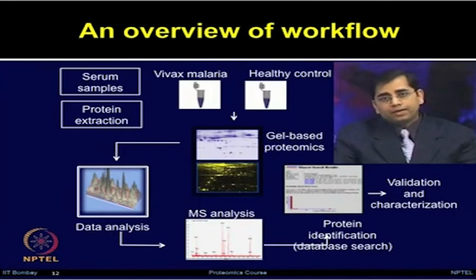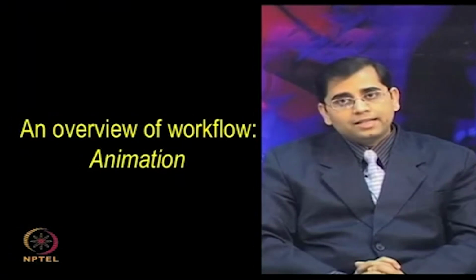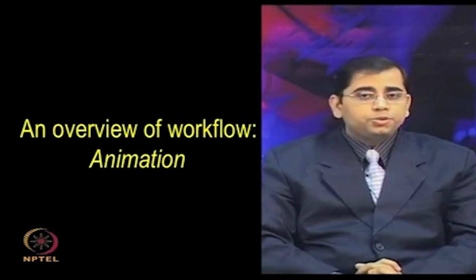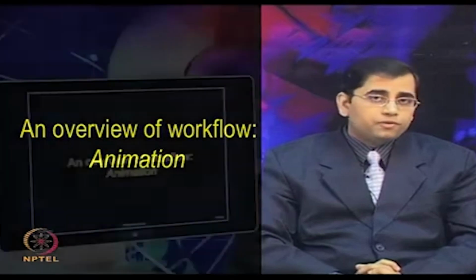Further, we validated a few targets and analyzed the data for various pathways which could be involved in such disease. Before we move to details of the various experiments performed in this study, let me show you this animation to give you an overview of the workflow followed in this experiment.